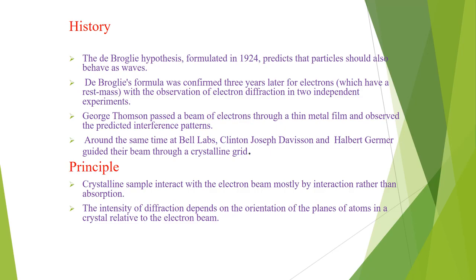The principle of this electron diffraction technique is that the crystalline sample interacts with the electron beam, mostly by scattering rather than absorption, and the intensity of the diffraction depends on the orientation of the planes of atoms in the crystal relative to the electron beam.